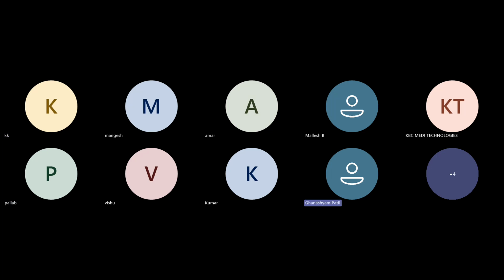Those are all points I'm going to cover topic-wise. Okay, thank you. Yes, Pallav. I have one query. We are using Caliber LIMS, that is eLIMS. In LabWare also eLIMS is available, right? Yes, connectivity with instrument interfaces, yes.